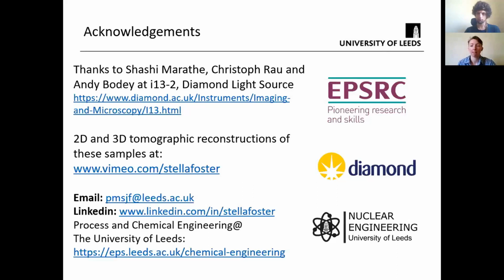And did you think about mercury porosimetry as a similar pore size measurement? This is a technique I don't know much about. I read that it works at certain high pressures, I believe, and that there is a risk of crushing the biochar.